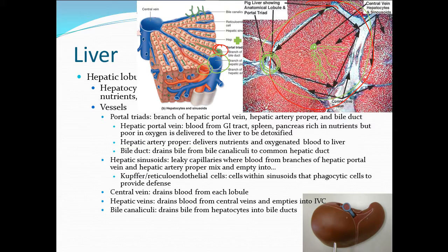The one structure that you haven't seen before is the bile duct over here. If you look at the bile duct, it'll have these simple cuboidal cells that make up a duct. So it looks something like this under the microscope.